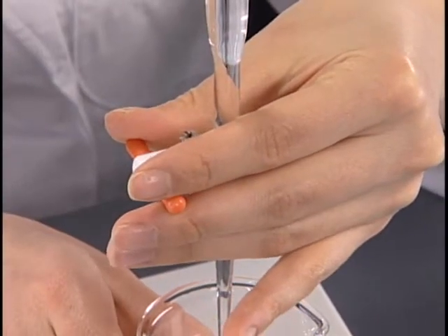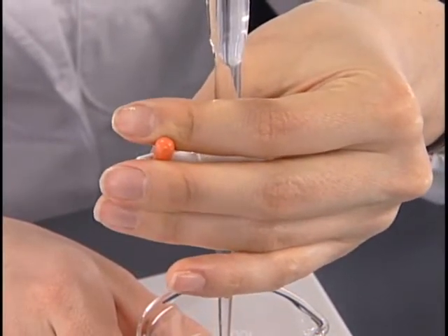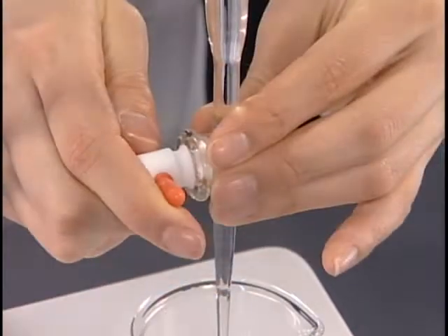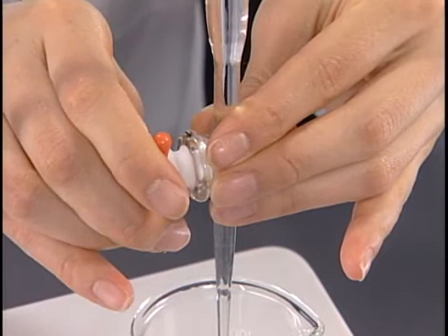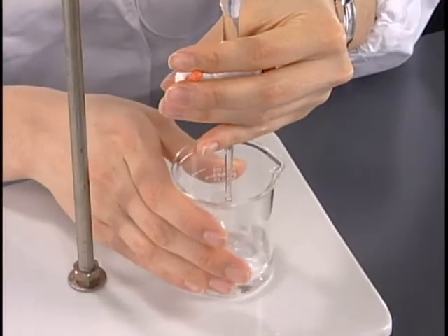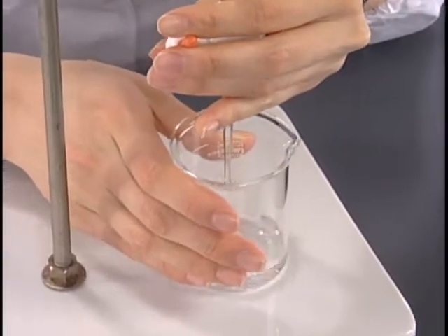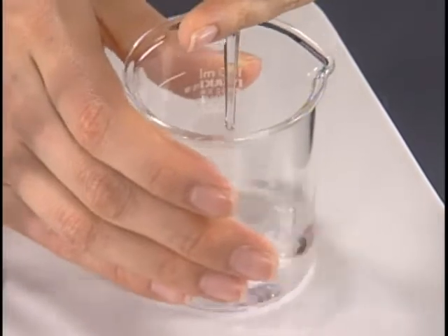Handle the stopcock with left hand to add the titration solution. Alternatively, one can handle with both hands. Shake the vessel to make the sample solution homogeneous during the addition.